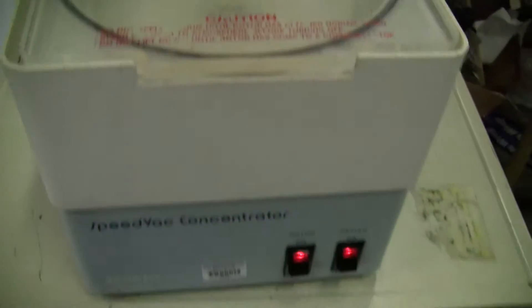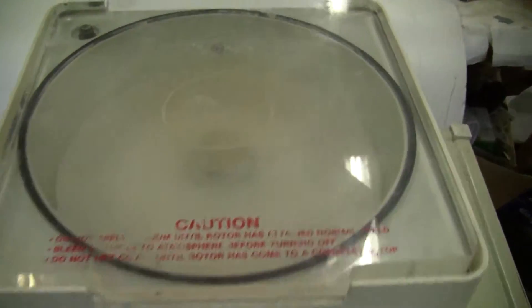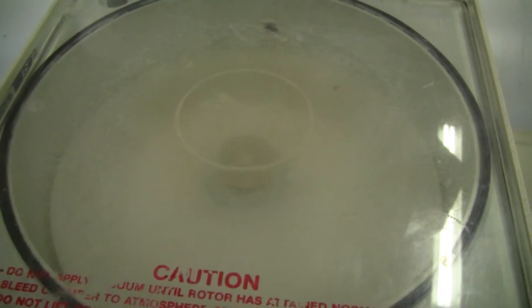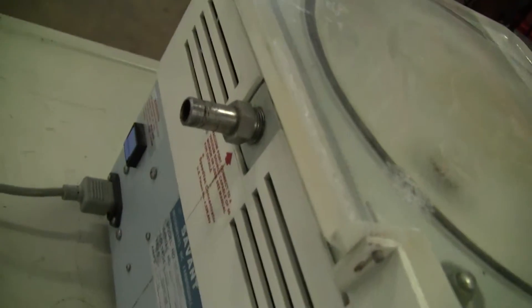The heater is on and it is working. Turn the rotor on — perfect, fine. Put it in the back and there's your port for your vacuum.